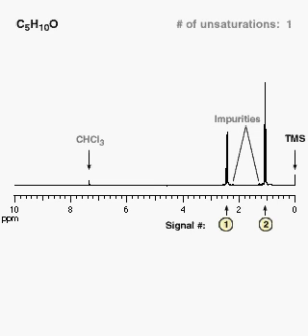The peak at 0 parts per million is the signal of the internal standard, TMS. The peak at 7.27 parts per million is the signal of chloroform, a common NMR solvent. Other small peaks in the spectrum are caused by traces of water and by impurities.